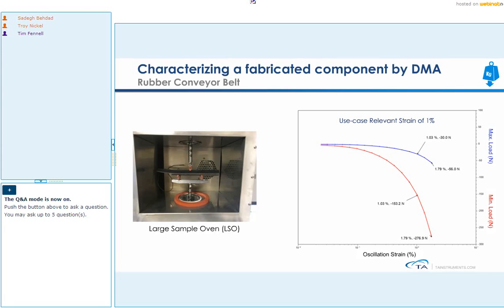In fact, there are some shear studies and shear type tests that are done in composites space that need very short spans, so that you create a lot of shear in the neutral plane, and you could do those, or you could go with bigger spans if you wanted to. So this is an adjustable 3-point bend clamp.